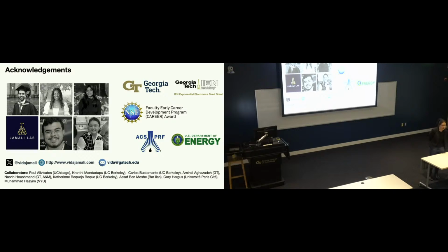For the single particle tracking that we do, you don't want it so concentrated that they're interacting and self-assembling, which is what other people, like Chen Chen's group that I showed earlier in the superlattice formation, do. What we are focused on is a dilute solution where you can identify particles individually. You move around and you see them. Usually you see a lot of them, especially at the corner of the liquid cell chamber, because it's thinner because of the spacer. You start to see a lot of them moving. It is not too complicated if you have a middle-level concentration. Thank you. You're welcome.